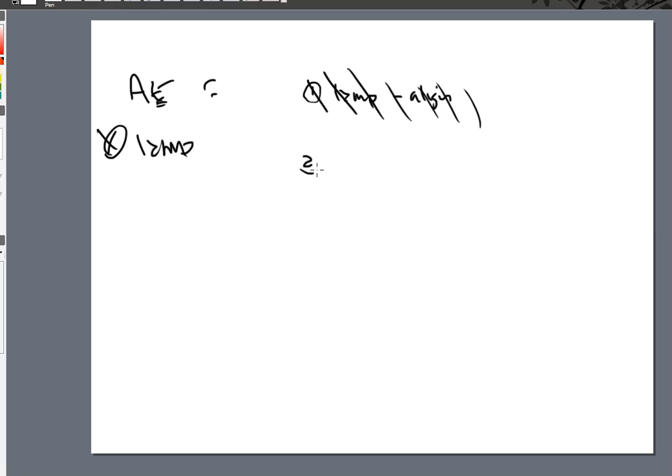Number two, what normally would happen is that you would look at maybe a cookbook. You would look at a cookbook, and you would make sure that your samples, your standards, have the proper wavelength. Wavelength is still important, ladies and gentlemen.